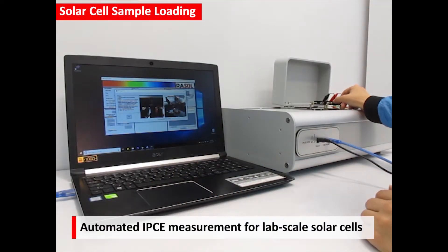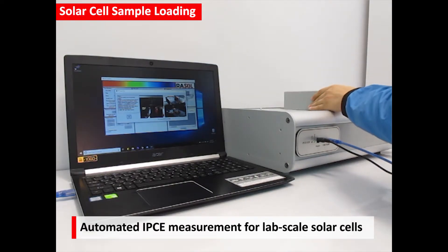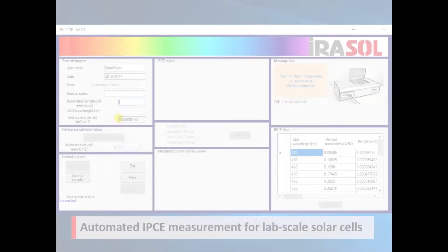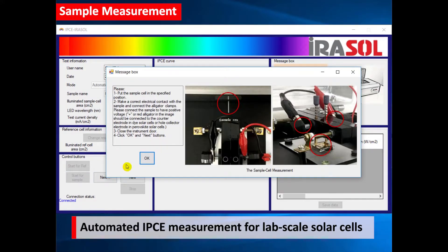The stage is then shifted to the sample measurement position, and the lid is closed. Now in the software, type the sample name and active area, and you are ready to start the measurement.